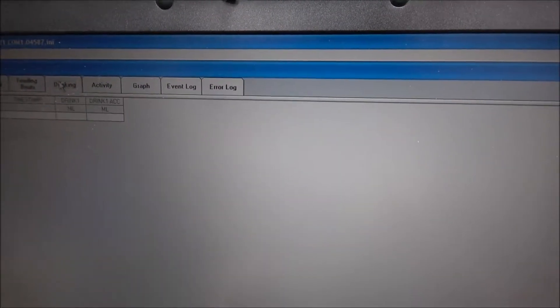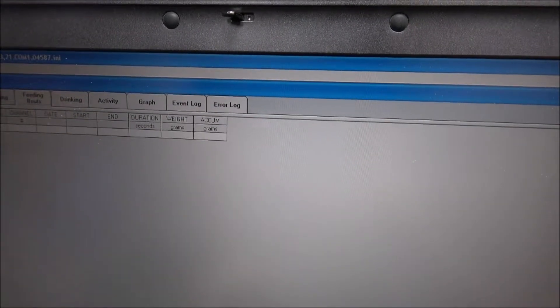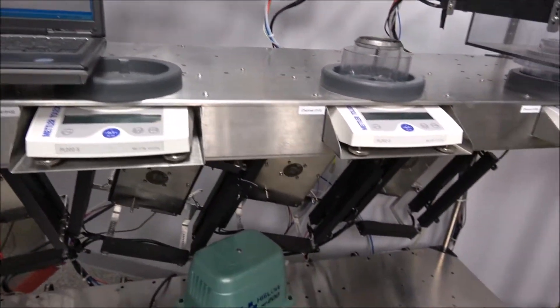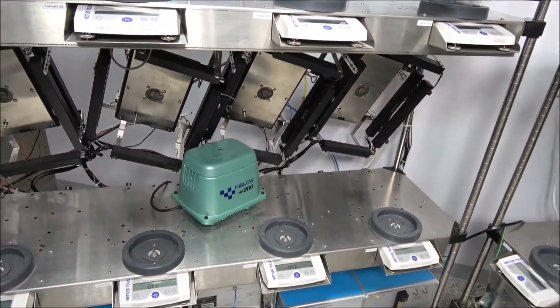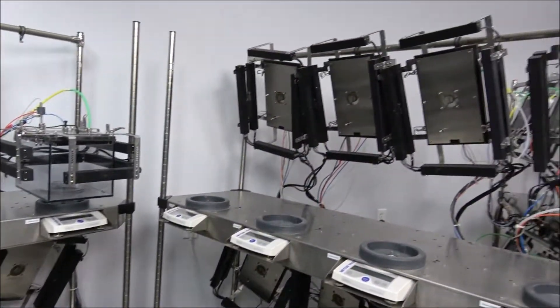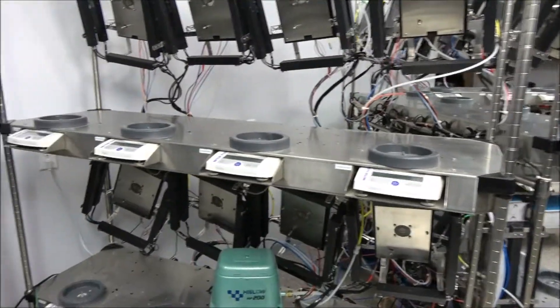The technicians have powered on all accessories included, but we're unable to test the accuracy of the sensors because we don't have enough cages nor the animals. This system includes four high-flow HP 200 compressors, carbon dioxide sensors, paramagnetic oxygen sensors, a sample dryer, volume drinking monitors, the Octomax Flowmax, and the CI bus serial interface.